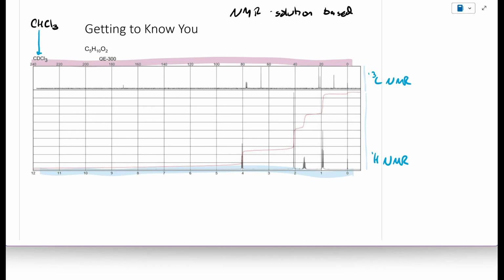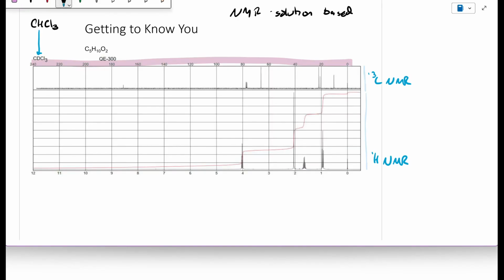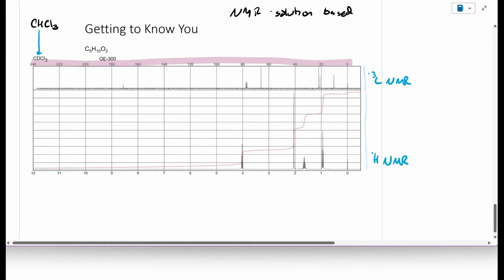Now, the chemical reaction that we use to turn chloroform into deuterated chloroform is not 100% perfect. Not 100% of the hydrogen atoms get converted into a deuterium atom. And so when that happens, we always end up with a slight amount of residual protiochloroform, a slight amount of chloroform that still has its proton. The hydrogen in chloroform would have a chemical shift of 7.2 ppm, roughly.